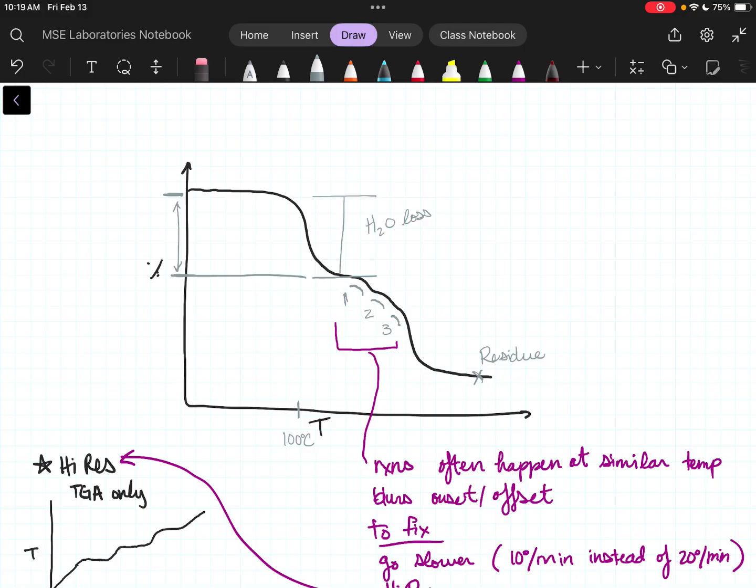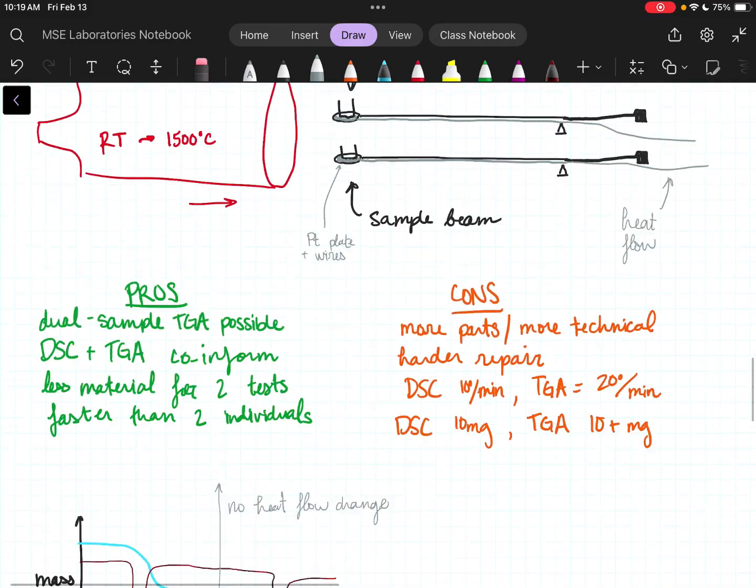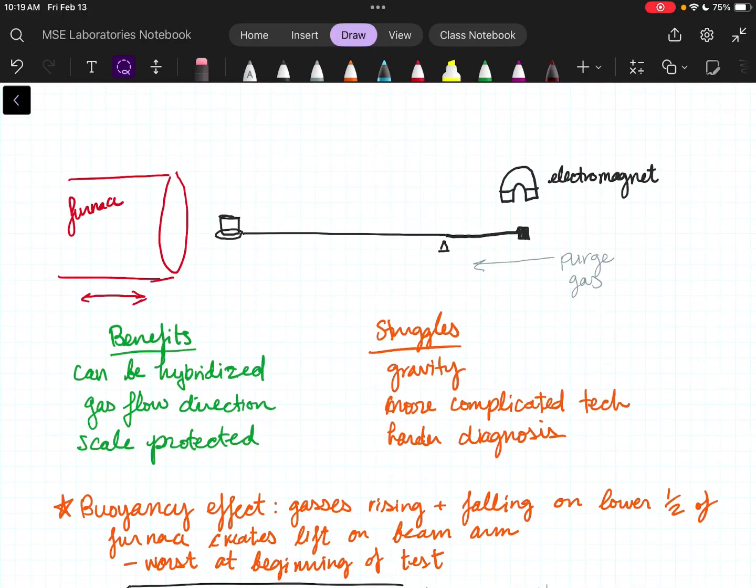And can you do like analysis on the residue and see, oh, hey, what the crap even happened? Like, yes, oh, so there's two more reactions that are occurring. What is actually here? You could take that residue and you could run electron microscopy on it, you could run FTIR on it, you could run XRD on it, you could run more TGA if you want to go to a higher temperature. So yeah, you absolutely can kind of recover that residue. Remembering we're only working with probably about 10 milligrams here. Yeah. So you maybe would want to create your residue in a furnace rather than in the TGA. But you absolutely can take this and run with it if you want.